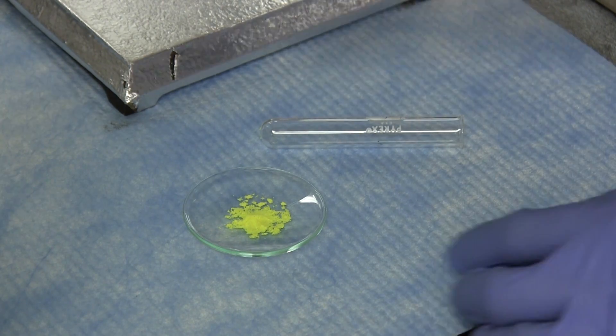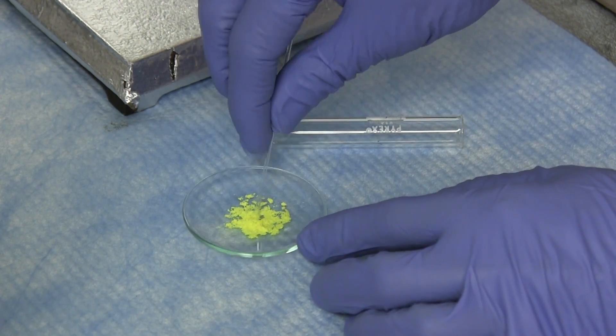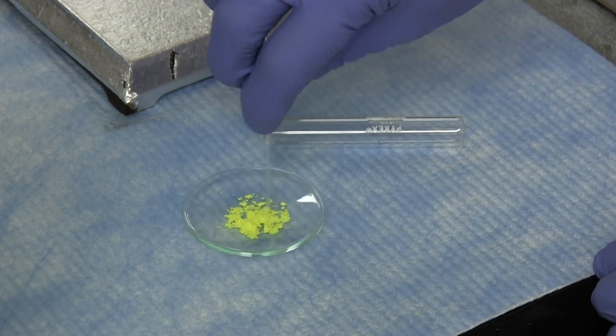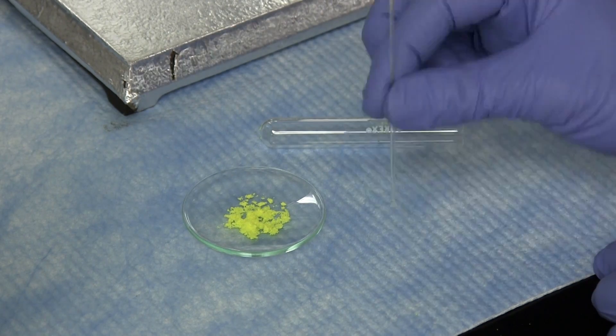The open end of the capillary tube is tapped into the powdered solid, inverted, and tapped several times on the bench top to allow the solid to settle at the bottom of the tube.